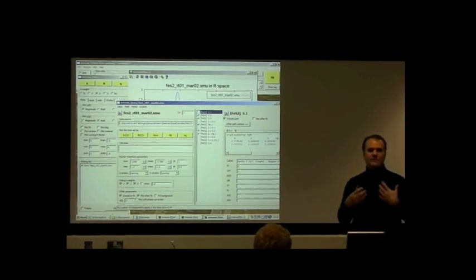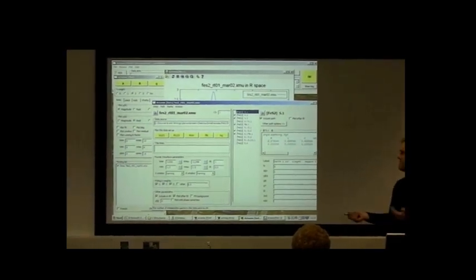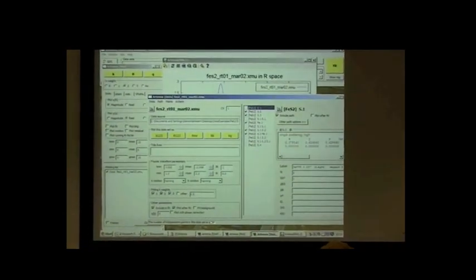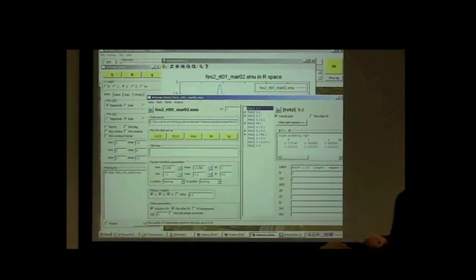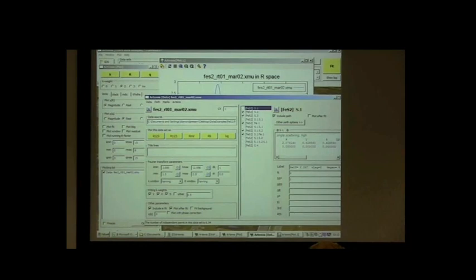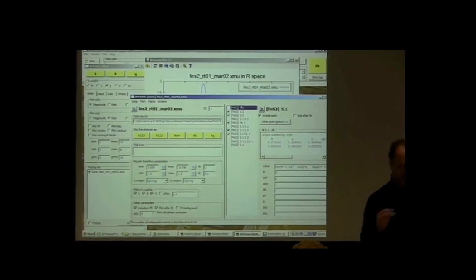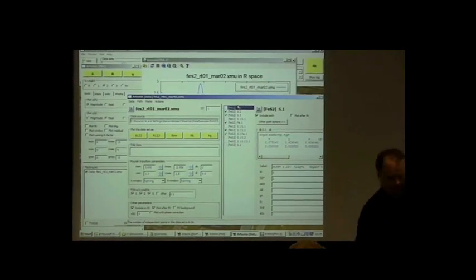What this says is that in the best of possible situations, we might be able to measure 6 parameters out of the data Fourier transformed over this range and fitted in this range, just the first shell. Now, we're only going to need 4 parameters to do this. So that set the fitting range to be like that.